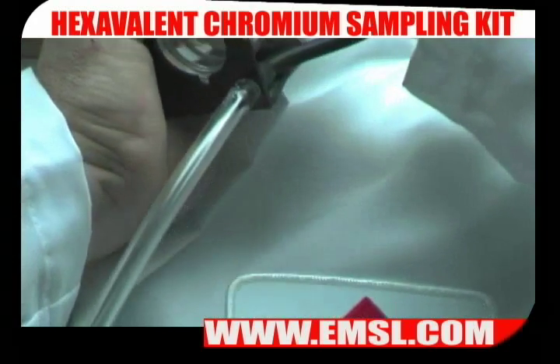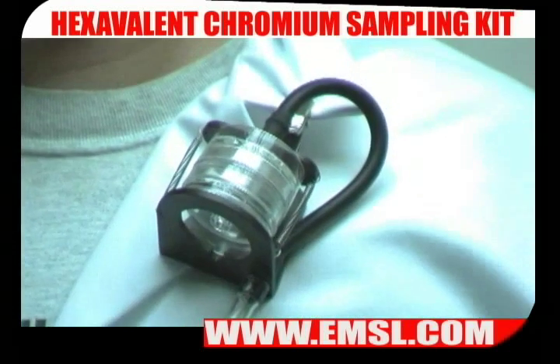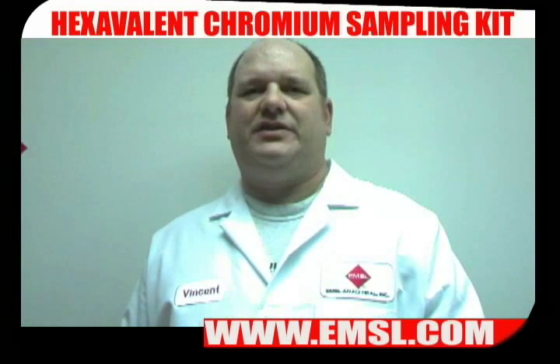For instance, on a worker's lapel for exposure sampling. A typical sampling period for hexavalent chromium is 8 hours. At the end of the sample period, check the flow rate.